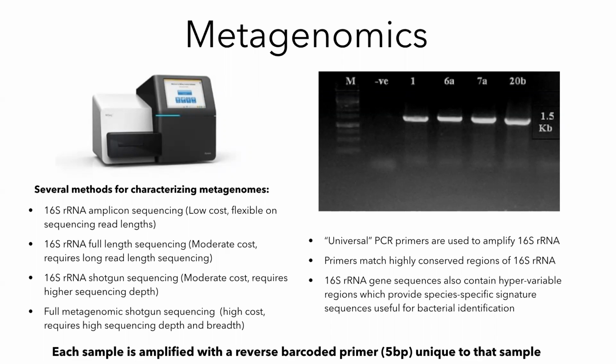And there we are looking at the differences from why we are doing the sequencing. In other words, what is the objective of our study in terms of cost, how affordable, so maybe that means how many samples we can sequence, and also talks about how detailed do we need to get our result. So how much detail are we looking for?